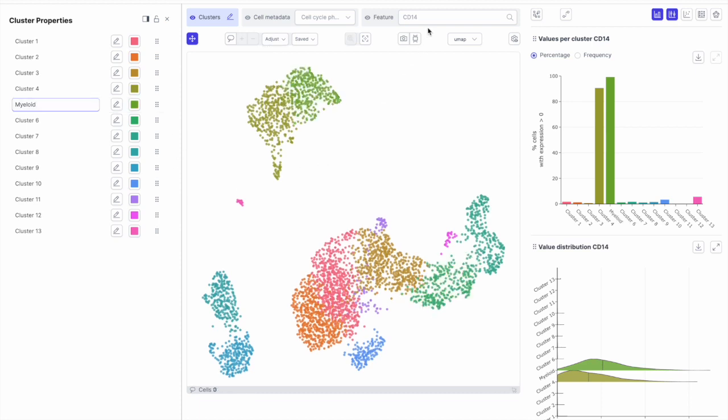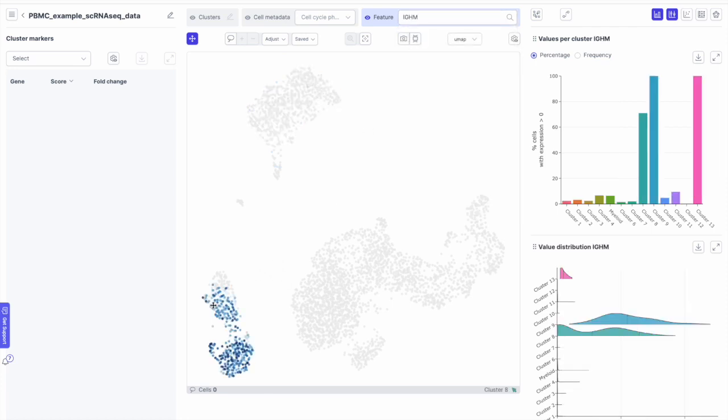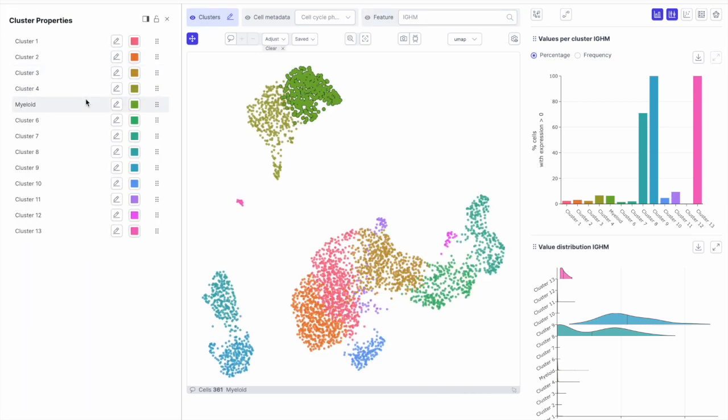And then we can look for, for example, B cells with some marker gene. And this quite clearly lights up this cluster 9. And we then label cluster 9 as B cells. And we can go on like this.